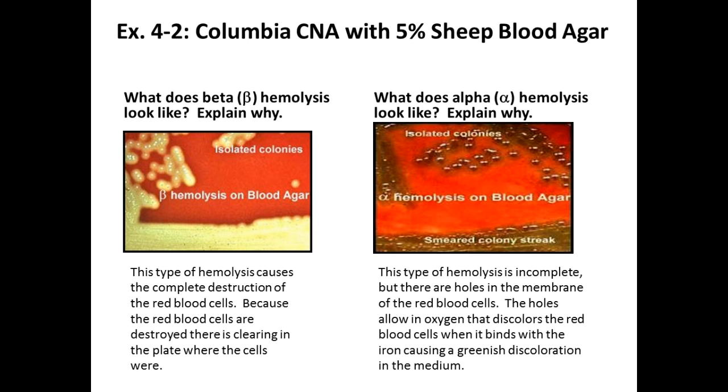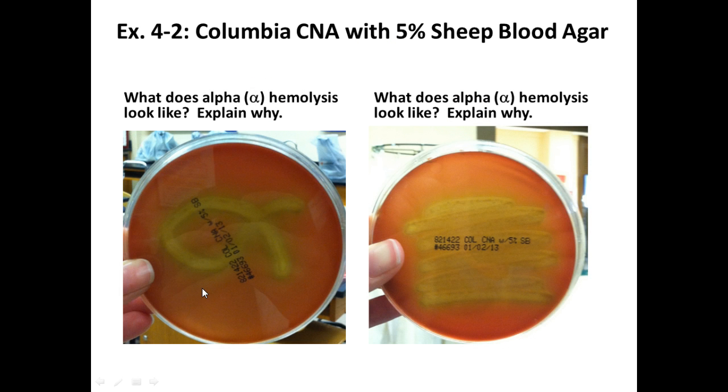And that's why, you know, that beta one I think has some alpha in it too, because if you looked at it, right, you saw some greenish discolorization too. So I think it might unfortunately be a little bit of a mixture. So some of you guys that have some organisms, most of the characteristics are going to be very similar down to this plate, right? So you're going to really need this plate to figure out which specific organism you have out of the group in the table, and I don't remember if I added it in here or not. So looking at these two, right, they're alpha.